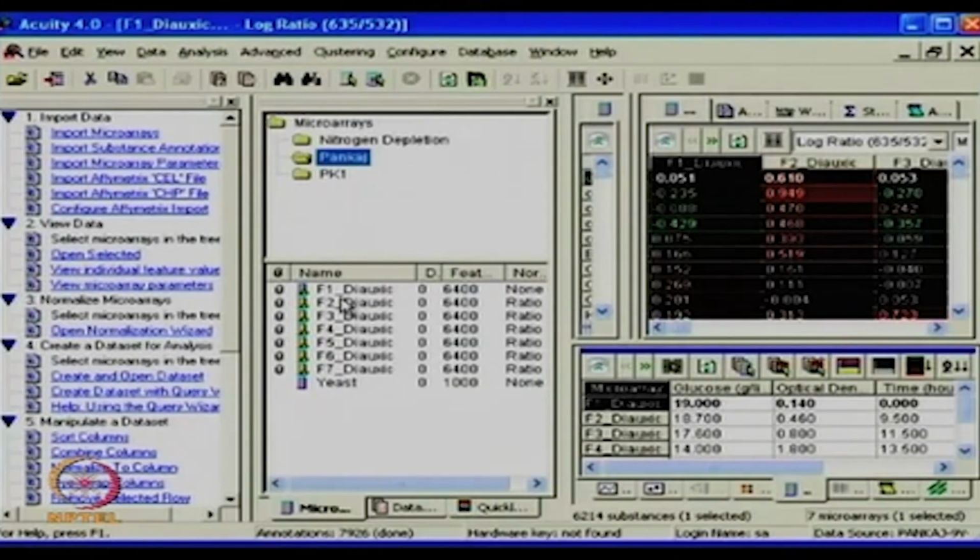So this is a ratio-based image which we are going to see, and we have also got another file which comes from the text, to show you that it can also be imported. First you have to individually scan each of the images, make one folder where you group all of these, and then use that whole data set for the combined analysis.